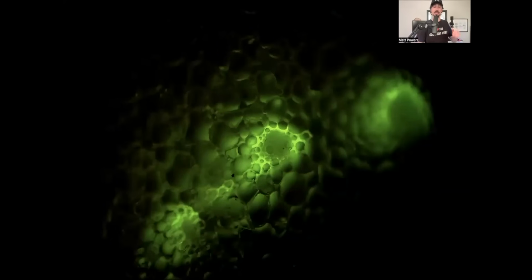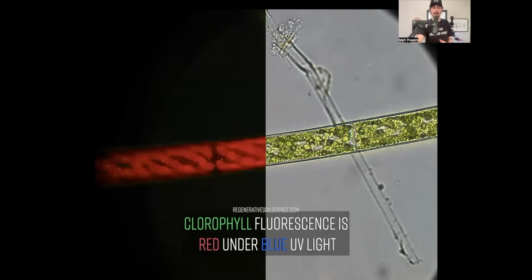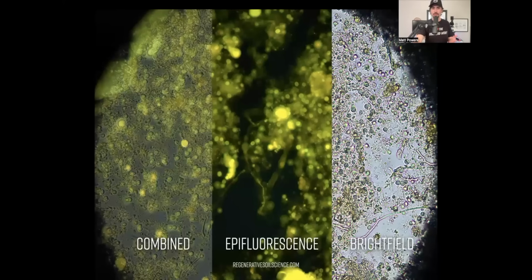So you can see the root is getting inoculated by that glow. That is the arbuscular mycorrhizal fungi migrating into those cells. This is fungi in the phloem. So we see that evidence of it traveling in the actual phloem of the plant. And this is fungal inoculated. You can see the one next to it, how it's not glowing. That is not fungally inoculated. And so it's been proven in many studies that fungi protects and lives inside the stomata and enhances it. Chlorophyll also looks red. There's so many uses.